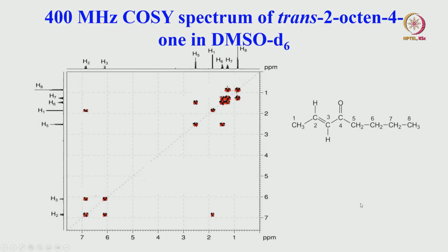With that, we will continue further today. We will take a few more examples of NOESY, how 2D NOE can be utilized to get the structure or conformation of molecules, from simple to relatively complex molecules. That is important, because basically in this course I want to tell you how we can analyze the spectrum, and how we can use different NMR techniques, 1D and 2D, to get structural information for your molecule. We will start with another molecule today.